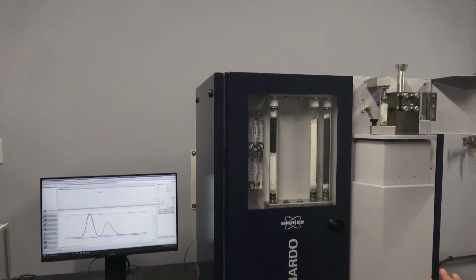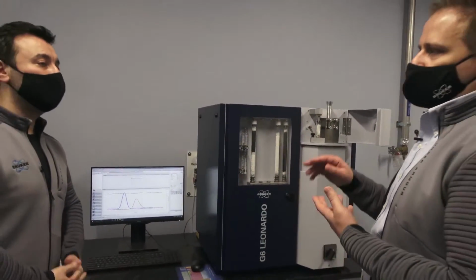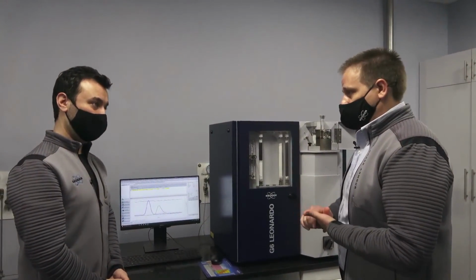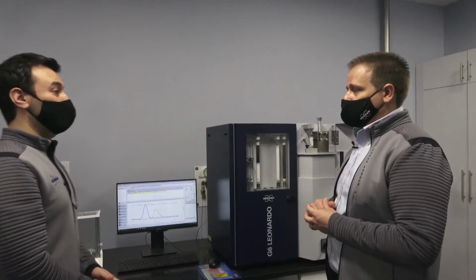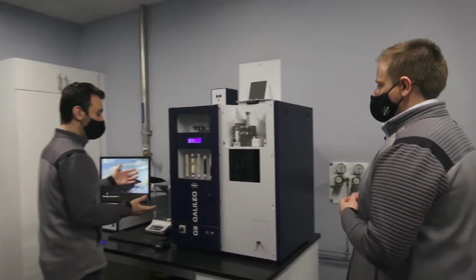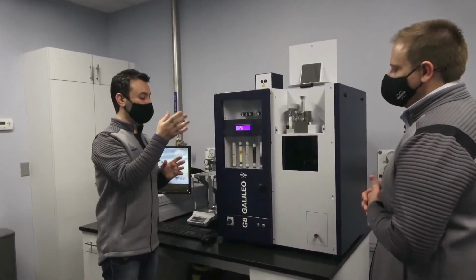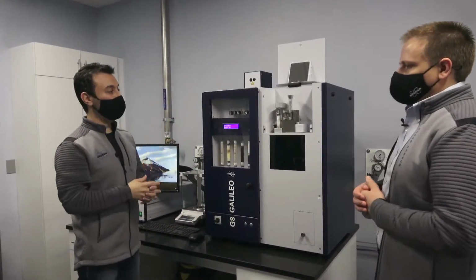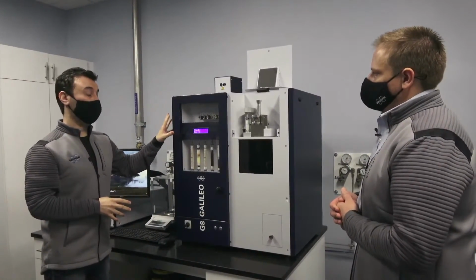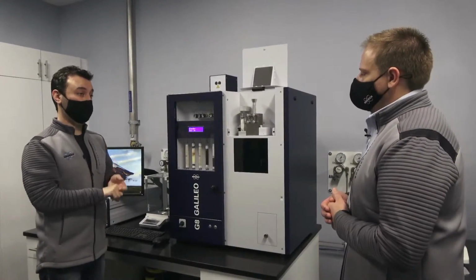Now, this instrument, the G6, is capable of measuring 2 elements. But if I wanted to measure 3, nitrogen, oxygen, and hydrogen, then I'd have to step it up a little bit. In that case, you would have to use another fusion analyzer like the G8 Galileo. So the difference between the G8 Galileo and the G6 Leonardo is that the G8 Galileo can have 3 different elements: oxygen, nitrogen, and hydrogen in one single instrument.